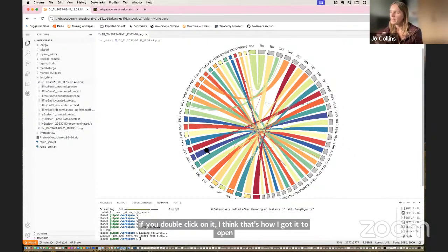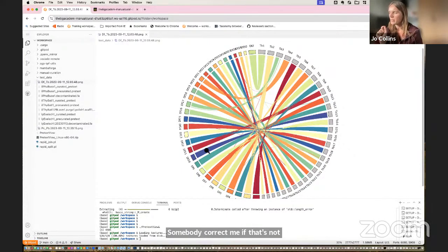What should open is this Circos Busco-Synteny plot. This is where we have a script that we can use in-house to identify a close comparator, or you can go in via the NCBI taxonomy browser, take your specimen and find something that's a close relative. Then we run an alignment with what you've taken to identify, in this case, our Z chromosome.